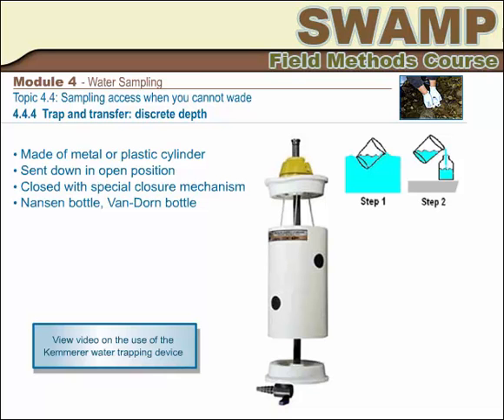You may have heard of the Nansen bottle or the Van Dorn bottle. Please click on the button to view a video about the Kemmerer water trapping device.